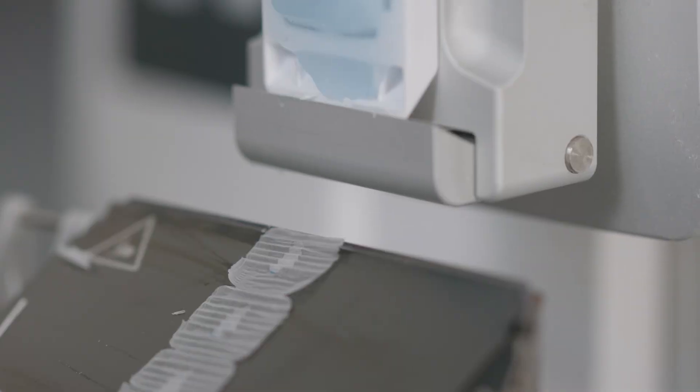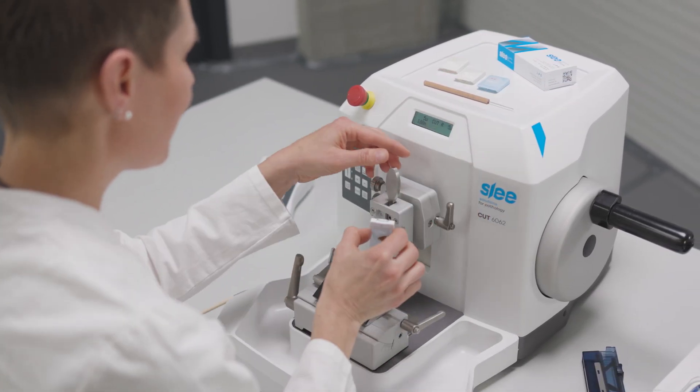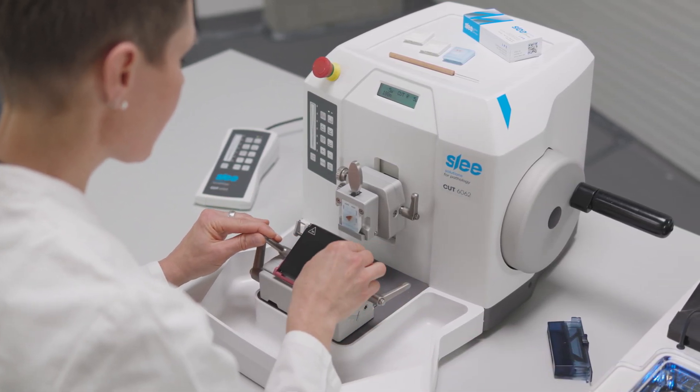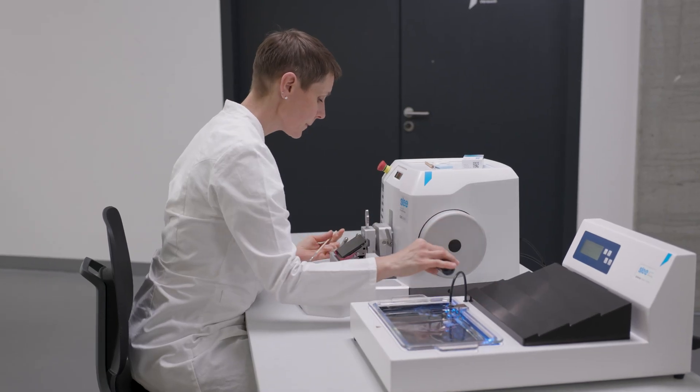The SLEE Microtome Cut 6062 makes your work easy every day. With quick insertion of the specimens, our secure finger protection, the interchangeable blade, and fast changing clamps, you can quickly and safely start the cutting process.